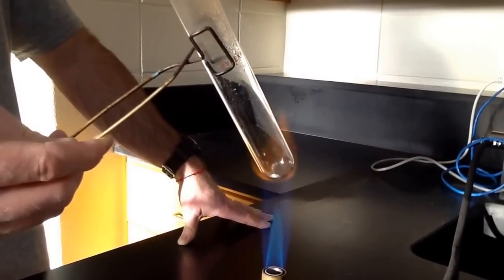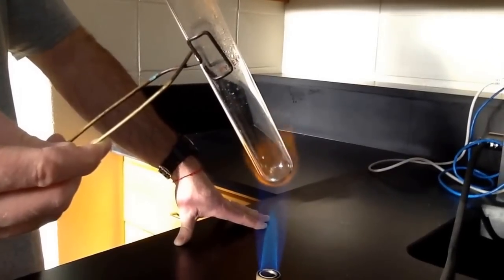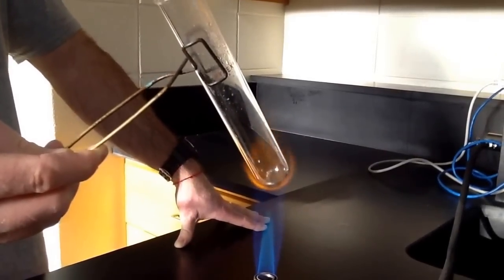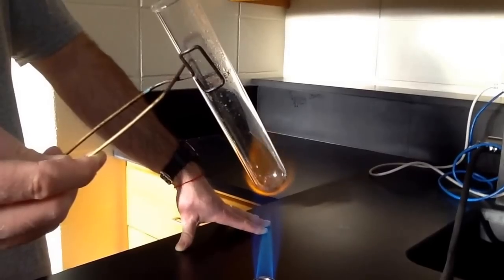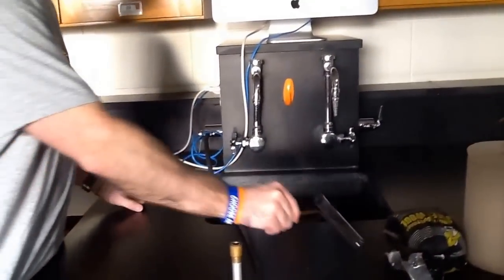And it's just about gone. So again, this is a decomposition reaction. We can identify a decomposition reaction because you only have one reactant, only one chemical you're dealing with. The only thing you can do is break down. All right, that's our decomposition reaction.